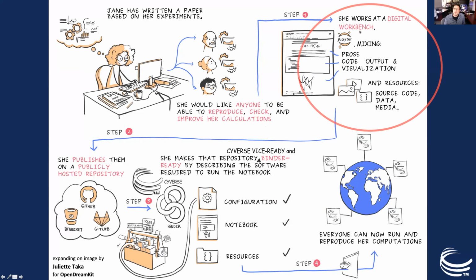And if you note, I also changed up here, instead of saying notebooks, because those are kind of sacred to experimental biologists, and we're not talking about electronic notebooks. We're talking about something very special. I think it's better to think about these as digital. You're providing a digital workbench where it's just like your experimental workbench. You have all the same equipment, all the same disposables, the pipettes, everything is the same. So I think workbench fits, and digital workbench describes this kind of environment that is provided much better.